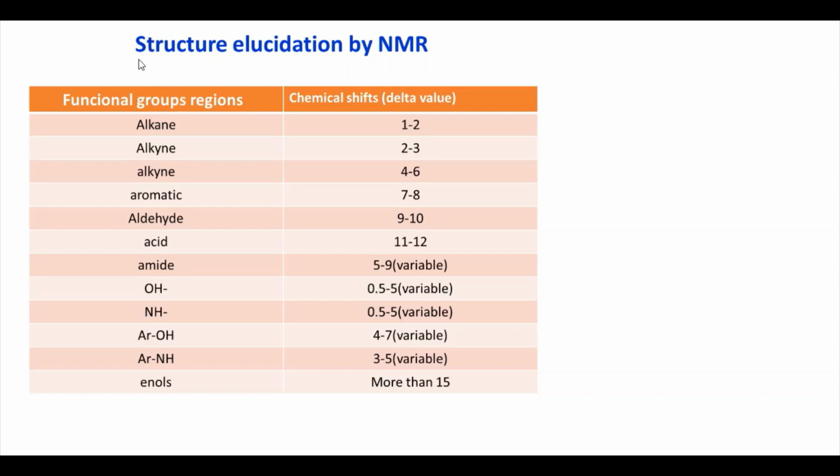Hello everyone. In this video we will learn how to interpret a structure from the NMR data or vice versa. One thing more I would like to mention is that I am not going to explain any concept regarding NMR spectroscopy here. If you want, you can write in the comment box and I will make a separate video for that.